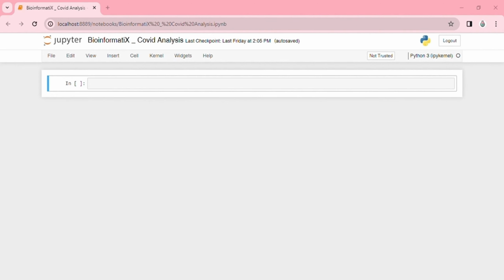Genome sequencing has increasingly become an important tool for studying disease outbreaks. The SARS-CoV-2 genome used in this study was sequenced from a sample of bronchoalveolar lavage fluid from a single patient who was a worker at the market, and who was admitted to the Central Hospital of Wuhan on 26 December 2019.